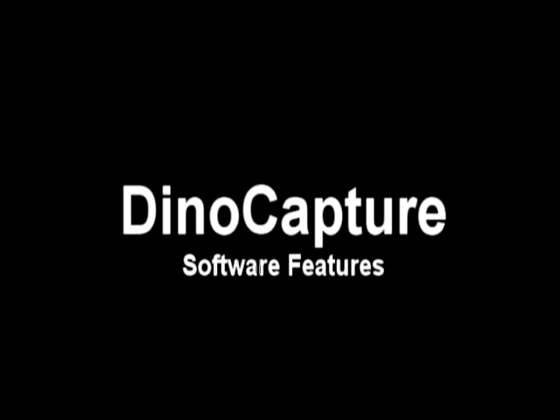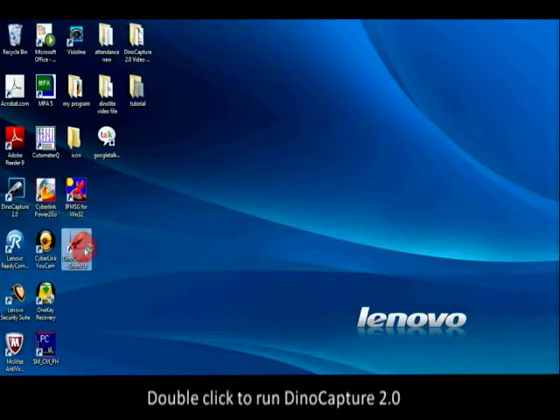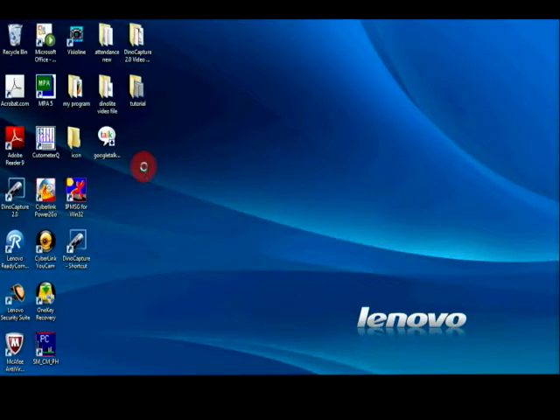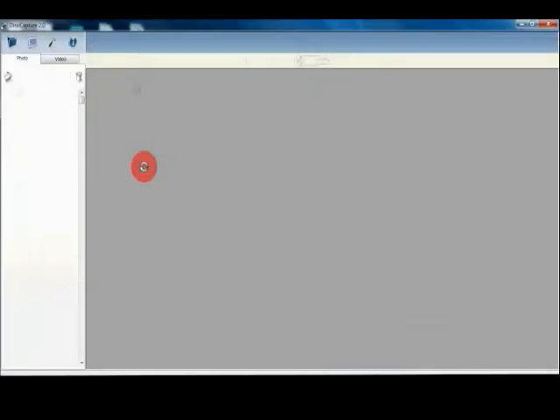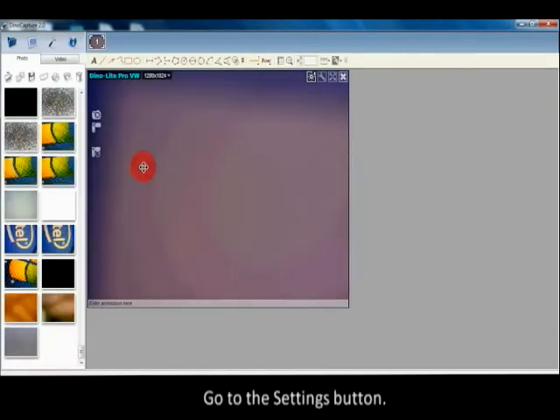DinoCapture software features: Double-click to run DinoCapture 2.0. Go to the settings button.